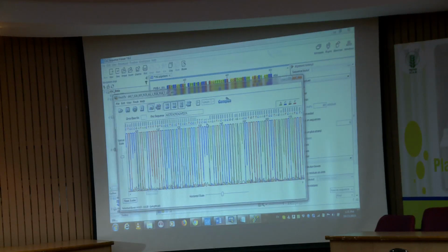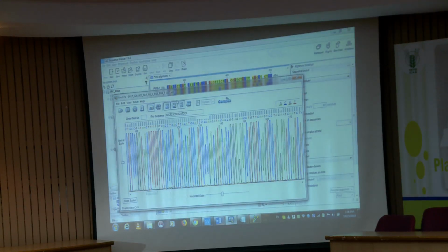Because we are using some enzyme for sequencing also, there is a slippage of that tag, and this appears because of that, right. But if you just see, the peak is quite good. So if in this alignment this T is there, then I will say okay, this T is actually T, I do not have to change it.